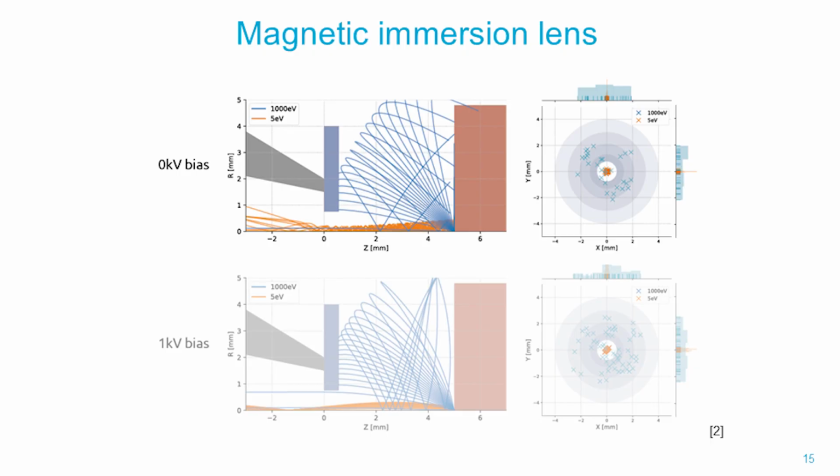This is a situation that is specific for this situation here with a quite high working distance. And note that in practice, if we work with magnetic immersion, the working distance in an SEM is on the order of 2 millimeters. It's relatively small to prevent this effect, and then actually we can enhance the collection efficiency of electrons on a detector.